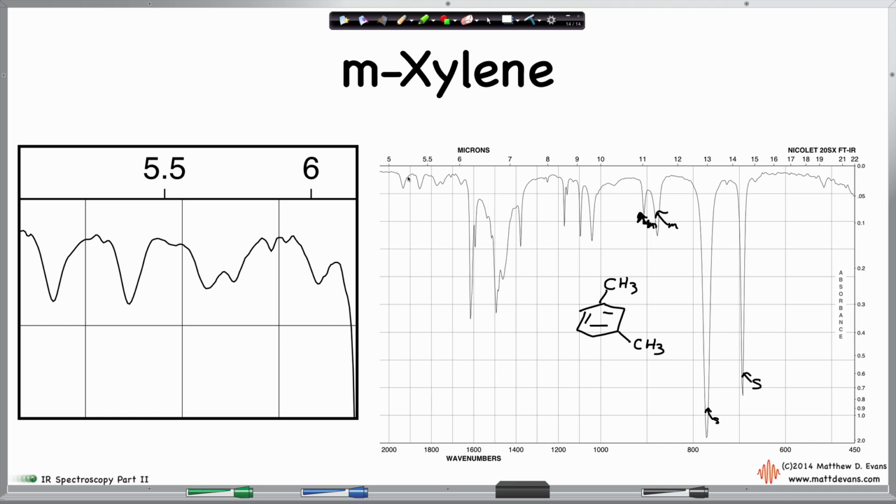Okay, so just like the previous example I was showing you, you can sometimes figure this out as well with this part of the IR spectrum. Again, search the Pavia textbook, the lab textbook, and you might see these pictures right here. But definitely these are characteristic.